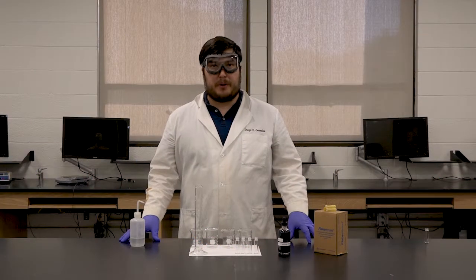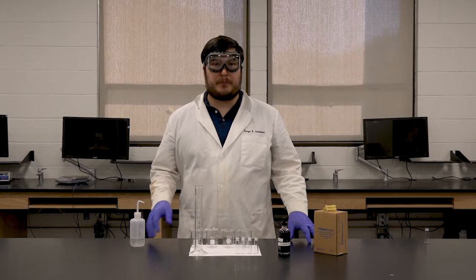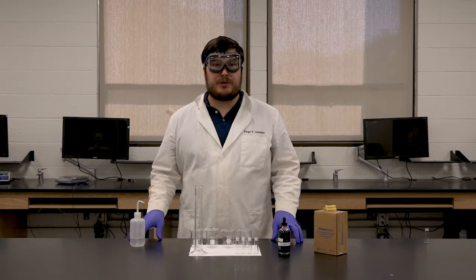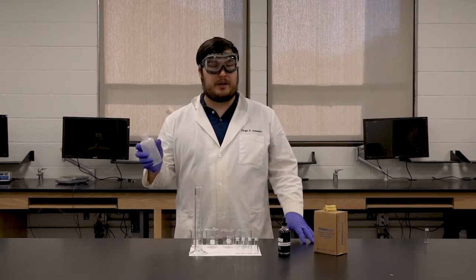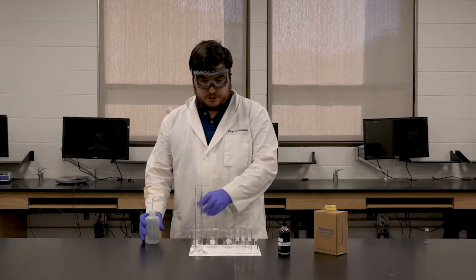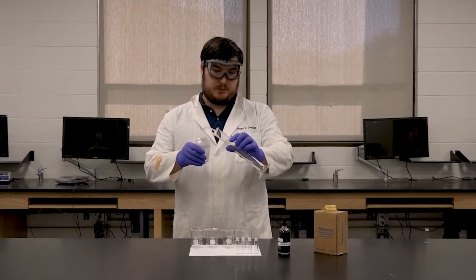For the second part of the experiment, we're going to go ahead and produce our solutions of the potassium permanganate with varying concentrations for the spectrophotometer. To do this, we're going to take our bottle of DI and we're going to fill 4 beakers with 20 mils of deionized water.